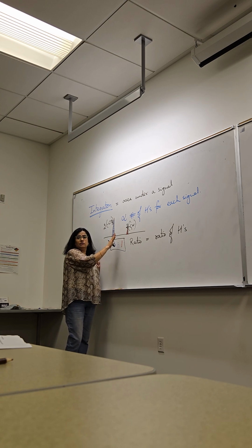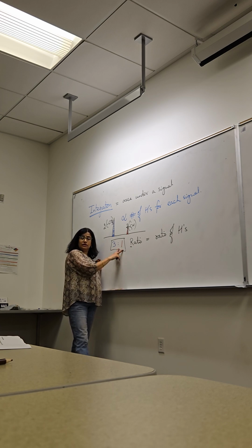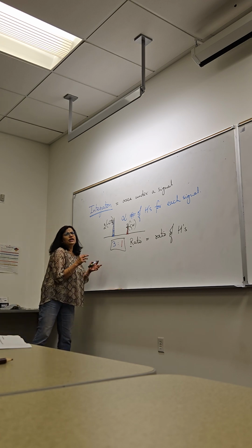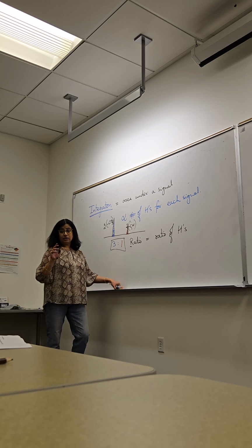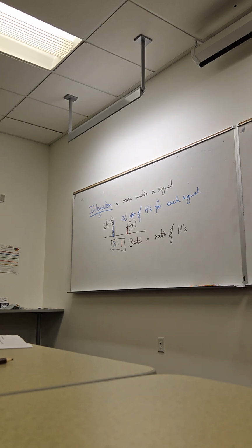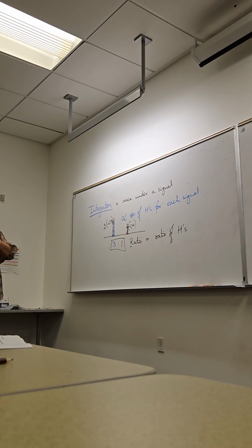In this example, where I'm hypothetically saying that it's 3:1, it will be 3:1. You guys okay with me? Are they all going to be whole numbers? Yes, because you're dealing with ratios, so you want whole numbers. If it comes out to 2.89, just round it to 3, because it's better to work with that. Is everybody following that? So you can determine those ratios just by looking at the spectrum. Exactly. And we'll look at actual spectra also. Once we are done with understanding the different parts of the proton NMR spectrum, we will analyze actual spectra.